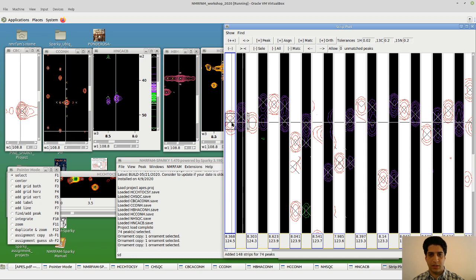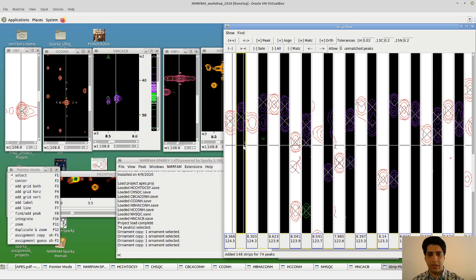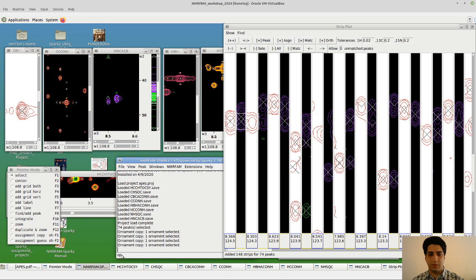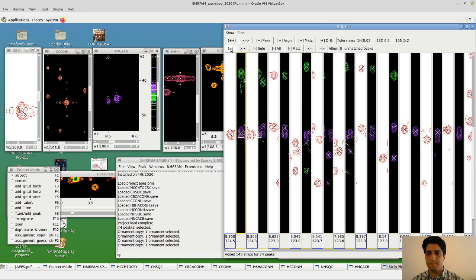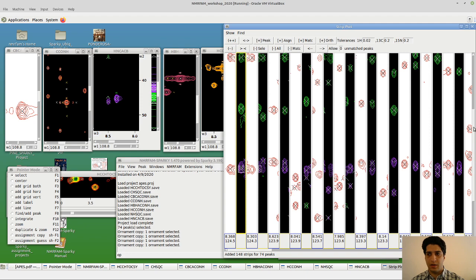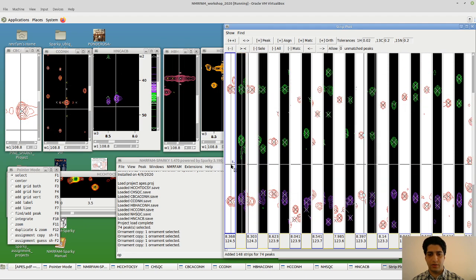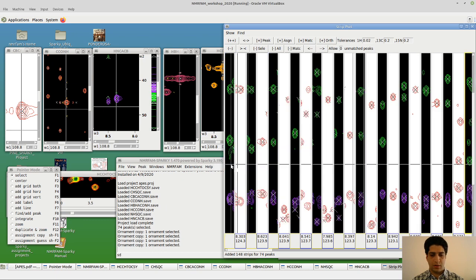So just click here, select it, OC, and if you go here, OP, I'm typing here, and you can see it. We paste that one here too. And now we have 2 and 4, so we can remove this one and this one.